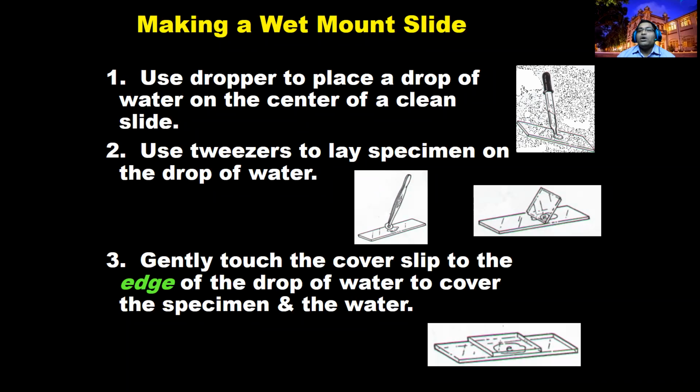By using water, right? For that purpose, use a dropper. You can use a dropper for the preparation of these wet mount slides. You need a slide, maybe a cavity slide, a cover slip and a dropper, right? First, take a clean slide.